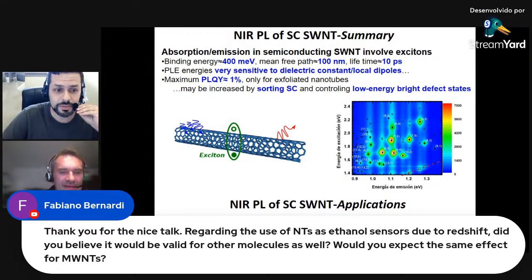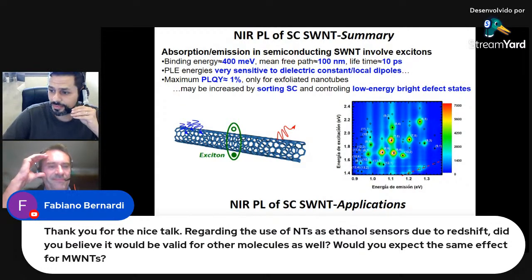Thank you for the nice talk. Regarding the use of nanotubes as ethanol sensors due to redshift, do you believe it would be valid for other molecules as well? Would you expect the same effect for multi-walled carbon nanotubes?